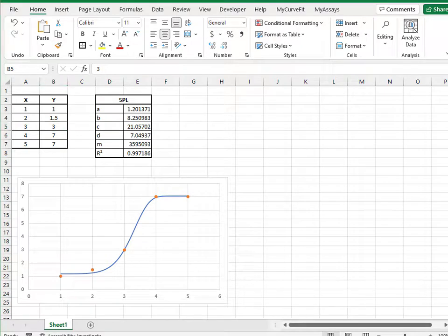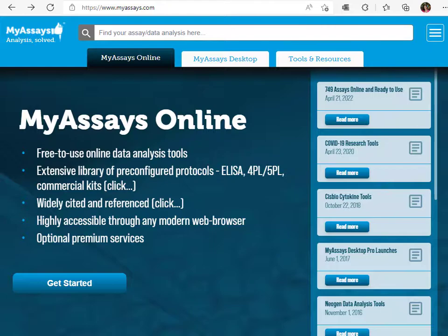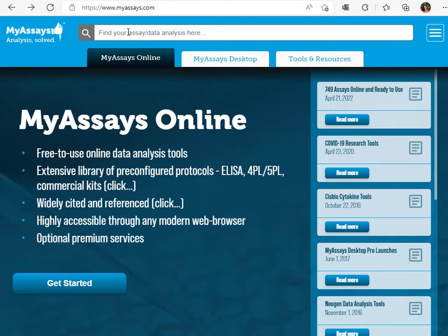By navigating to MyAssays.com and creating a free account, you will have immediate access to over 700 online data analysis protocols. Search for assays or fit methods using the search bar. For this example, we'll work with the general 4PL data analysis protocol.